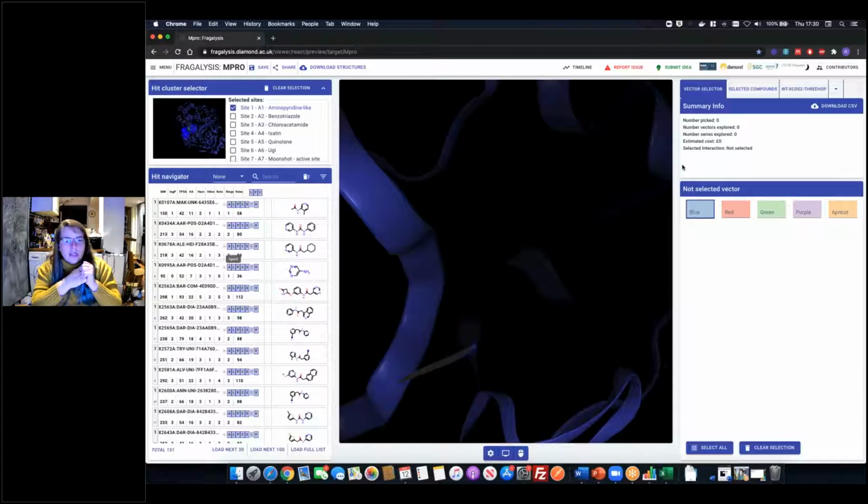When you're designing new molecules after that enumeration, when you're trying to work out which things to buy, you need to know what they're going to look like in 3D, whether you're making any new interactions that might be useful, making sure you're conserving things that you already know from the experimental data.